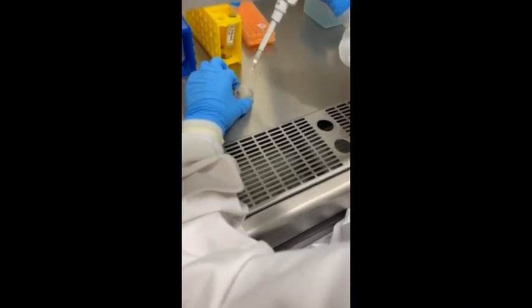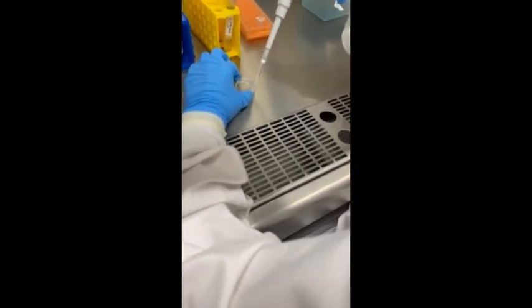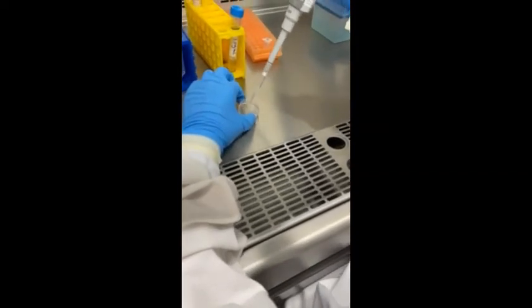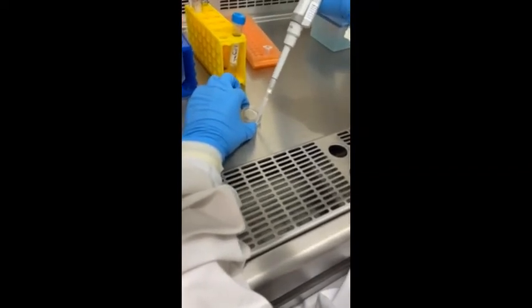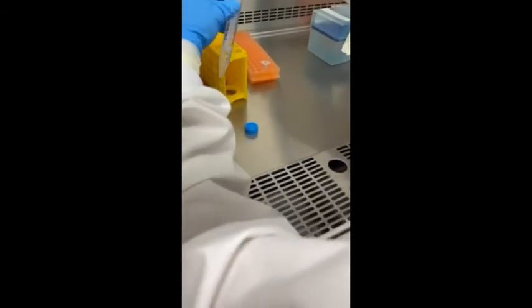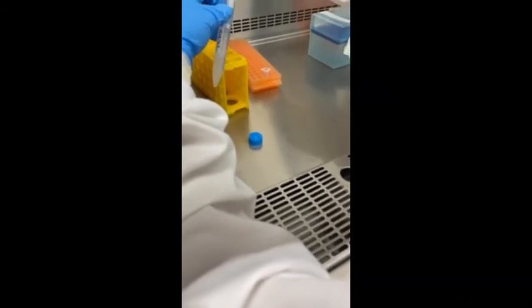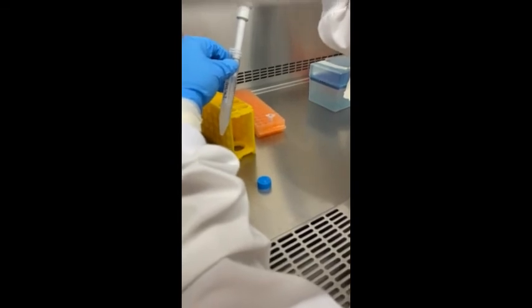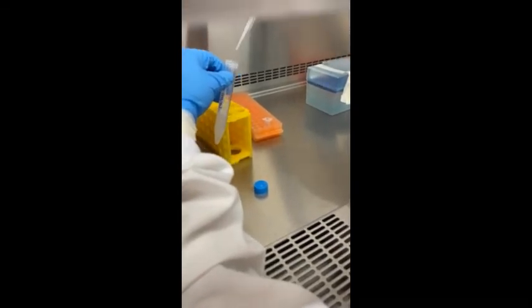After weighing and sterilizing your microspheres, mix them thoroughly with the TBS. Add the required amount to the BioInk solution, pipetting slowly to suspend the microspheres in the solution without creating bubbles.